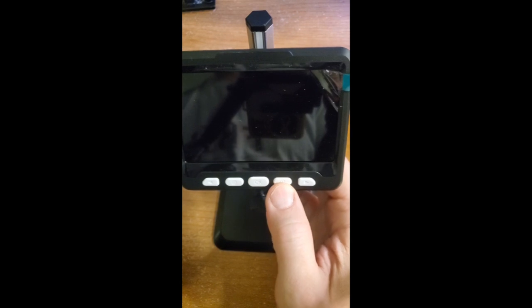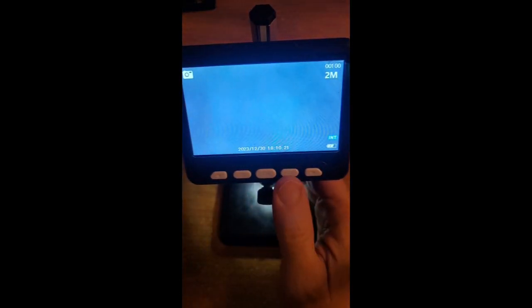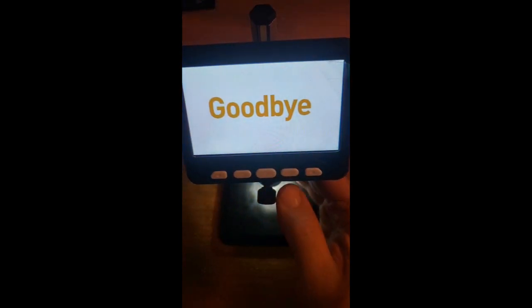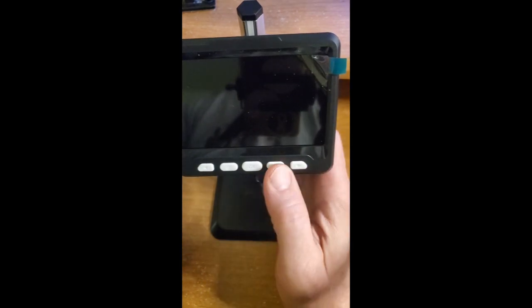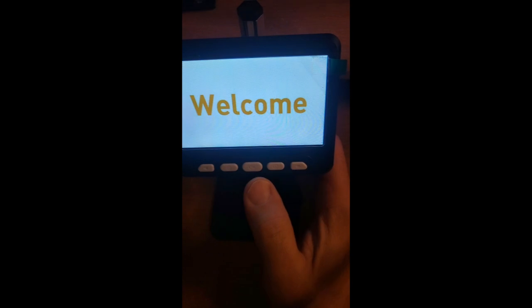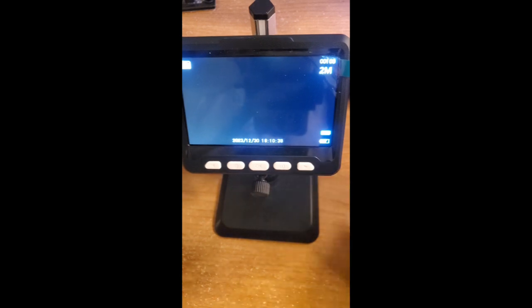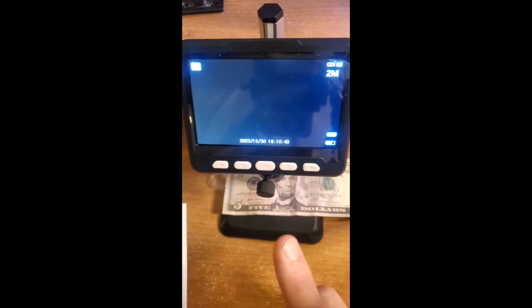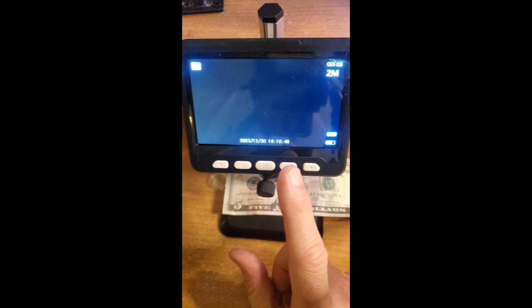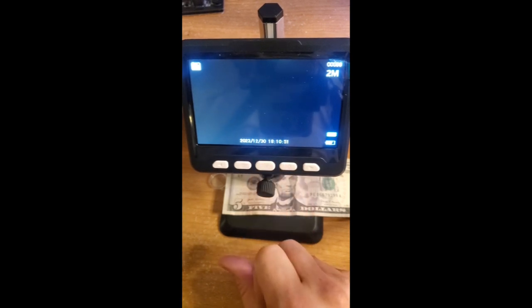This is actually the power button. Although I guess you have to hold it down. There we go. And hold it down again to turn it off, which, you know, that's pretty nice. I'm going to turn off the light just to save battery power. Get that back on again. To take a photograph when you're in observation mode, you'd have something underneath there. And try not to lose the protective lens. And then a short press of the OK button will take a photograph.